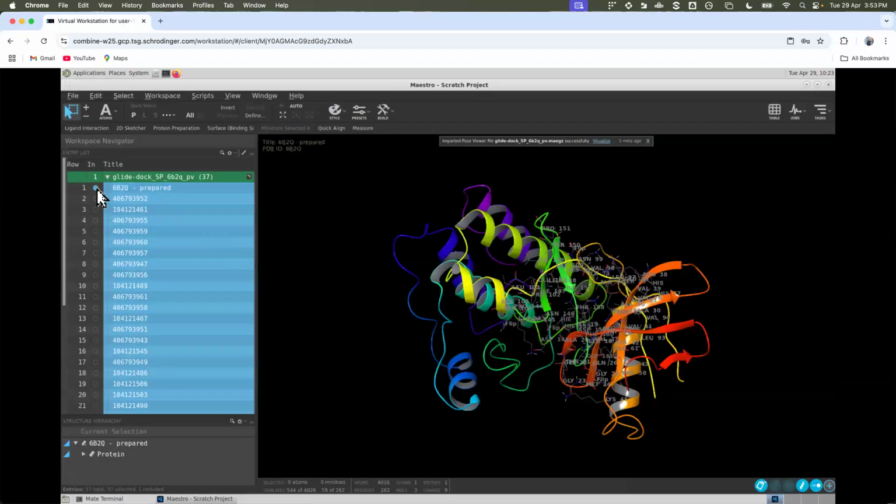So what you need to do, as I told, for the protein, just quickly double click here so that the pin option will appear here. Those who have some problem, the protein should always be there in the workspace. If you double click, the pin option will come.